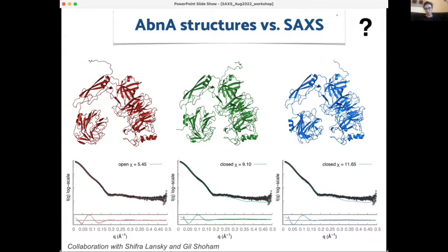So anyone wants to guess what's going on? Do they look similar to you, the structures? The disordered regions are different. Disordered, yeah, but it's quite a big structure, and the disordered region is not that big relative to the whole structure. There are several domains here. I try to look at the distances between the domains in the 3 structures. Just the motion of the N-terminal domain. Yeah, so we can see that the distance here is shortest between those domains, N-terminal and C-terminal. And here it's probably the largest, here it's something intermediate. So based on those structures, we can say that this is a flexible protein, domains are moving.